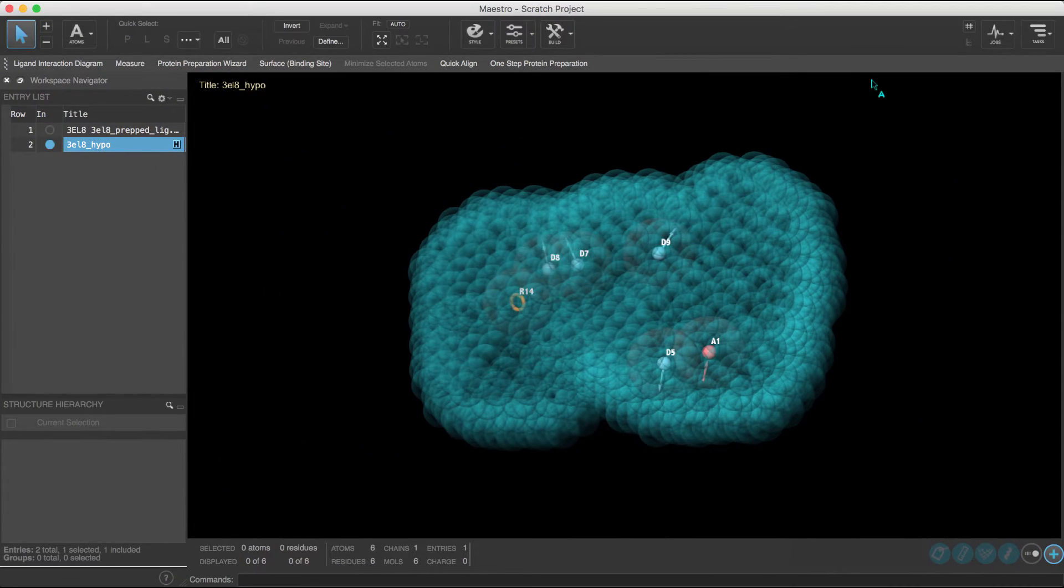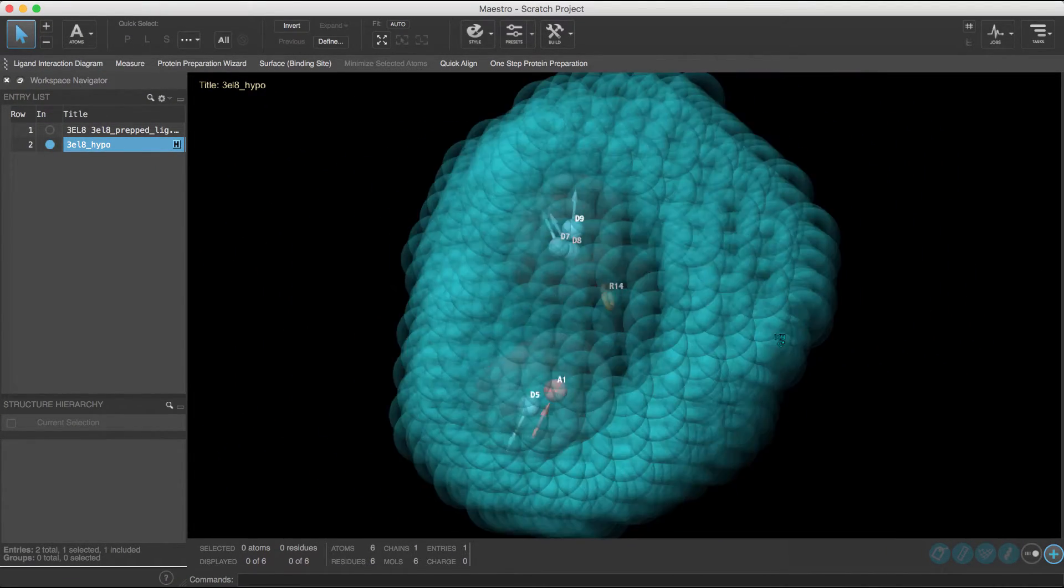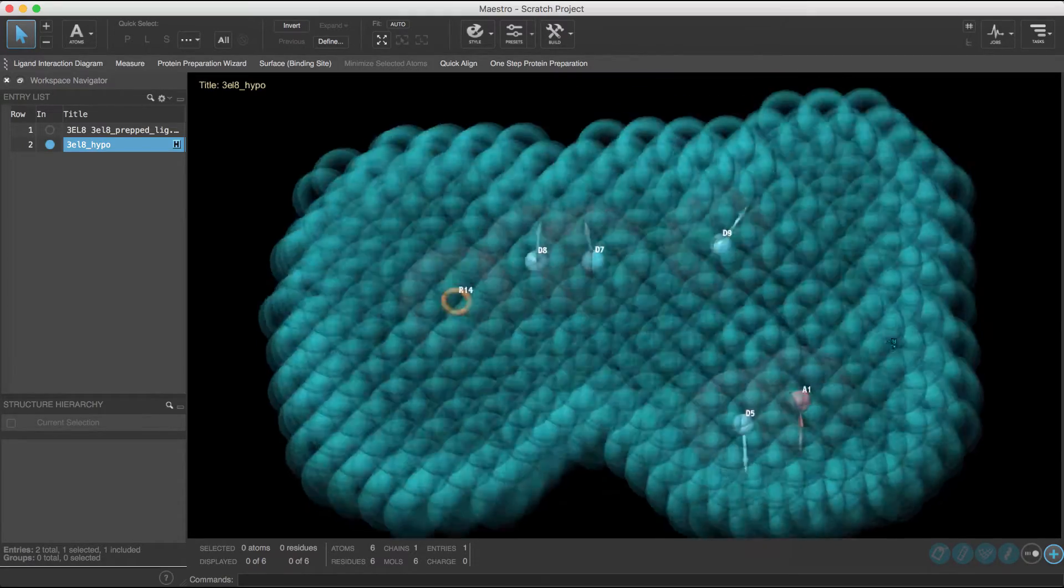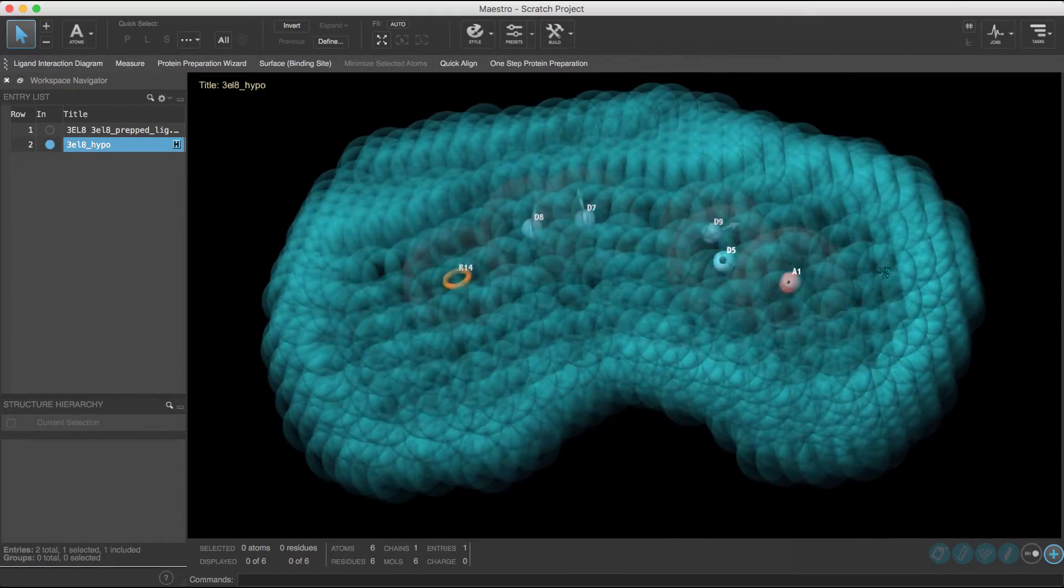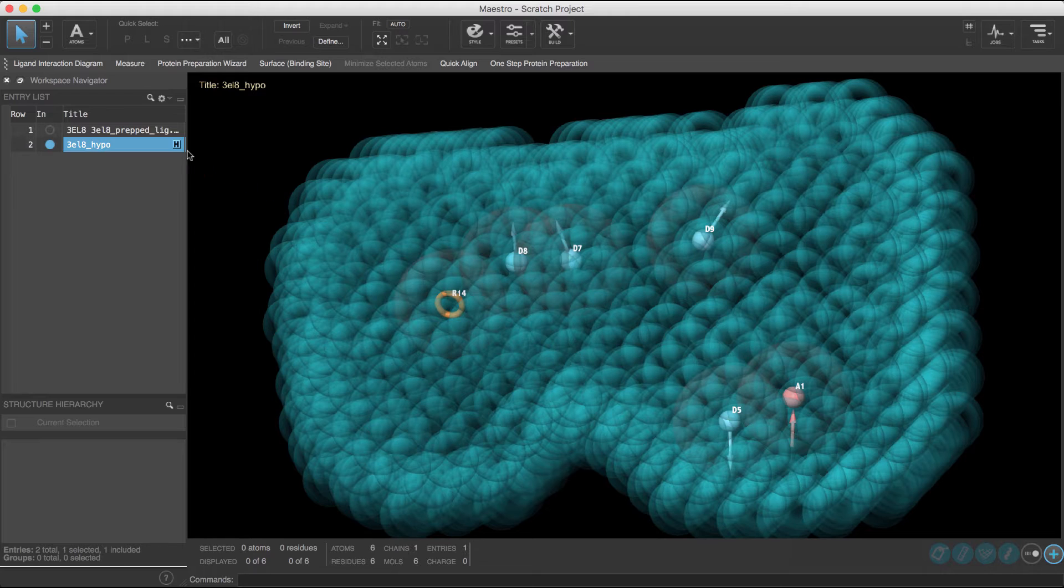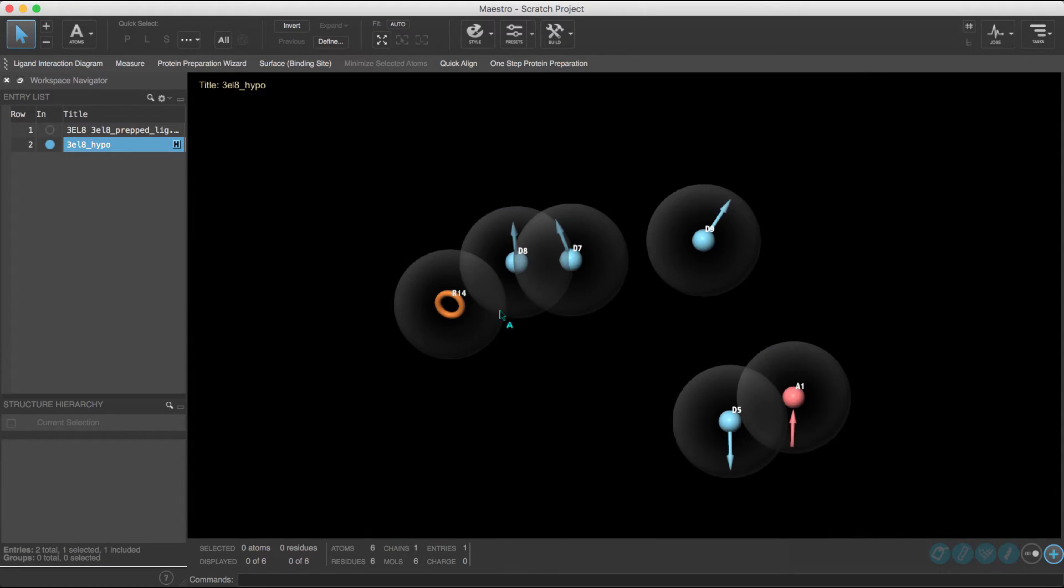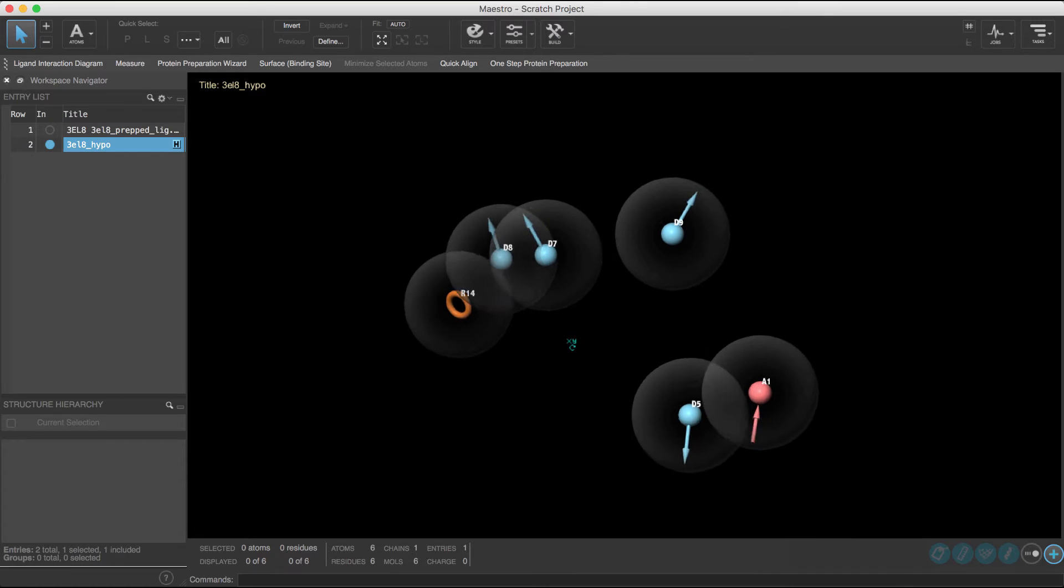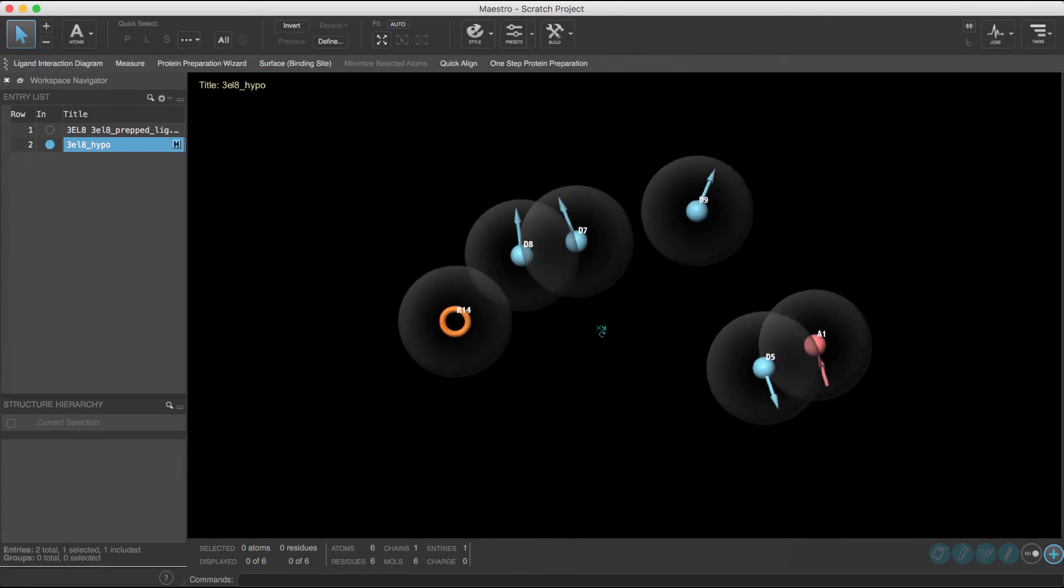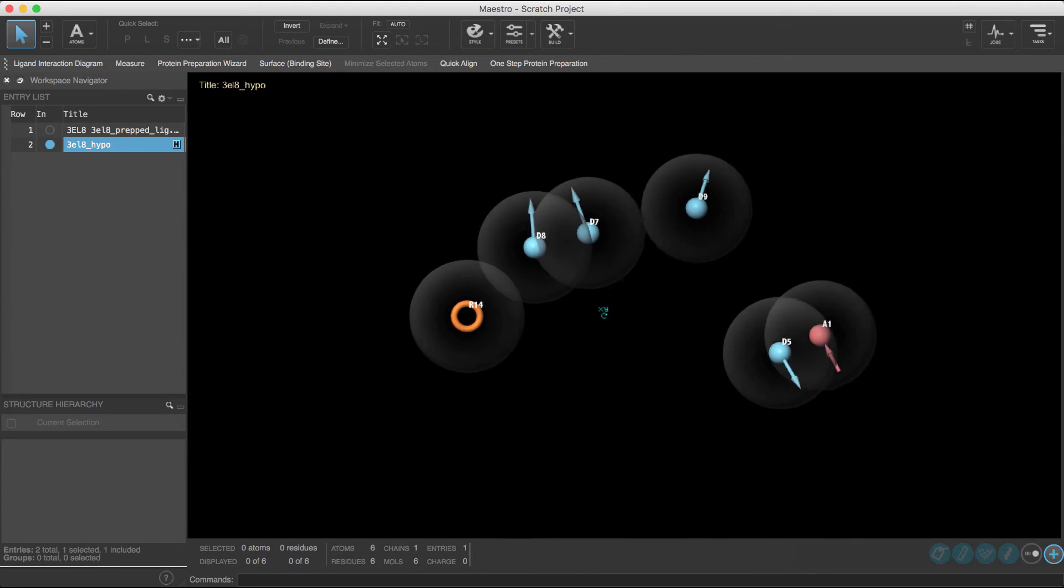We'll close down the panel and reveal the created hypothesis in the workspace. Now, it might be a little bit hard to see the features inside the excluded volume shell, so we can go to the blue Hypothesis H button on the entry to hide the excluded volumes. The hypothesis is now ready to be used for screening.